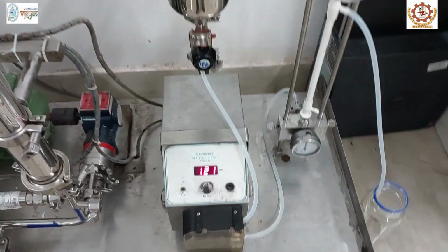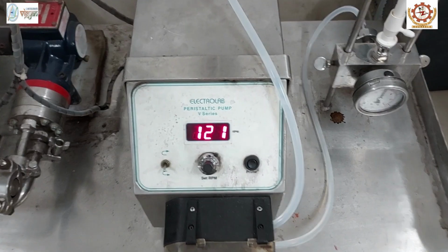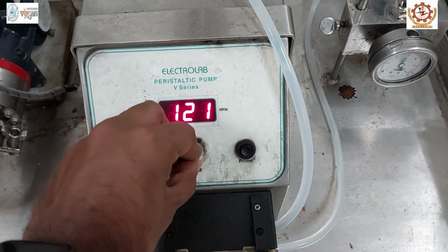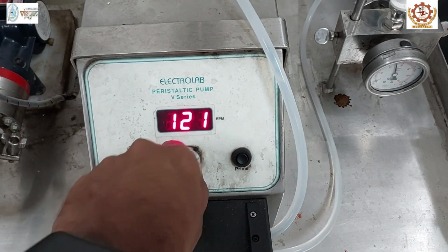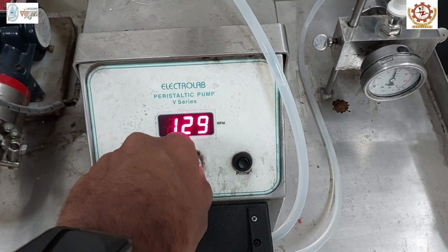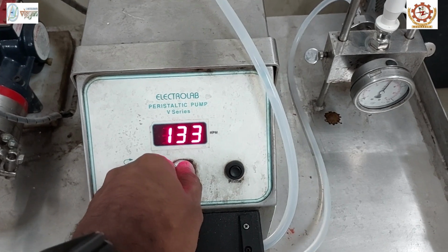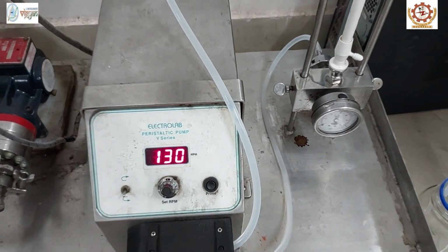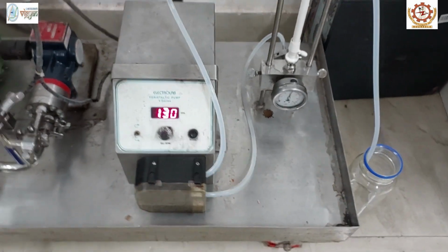Here the pump rotates at 121 rpm. We can set the rpm. Here the rpm is set according to the trial and error method. I have kept the rpm at 130.